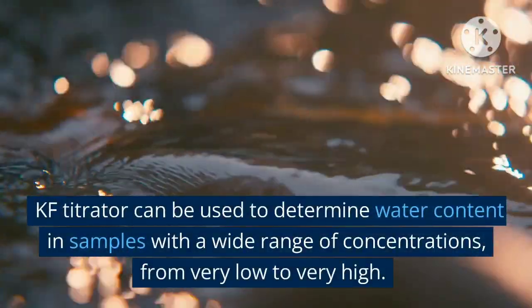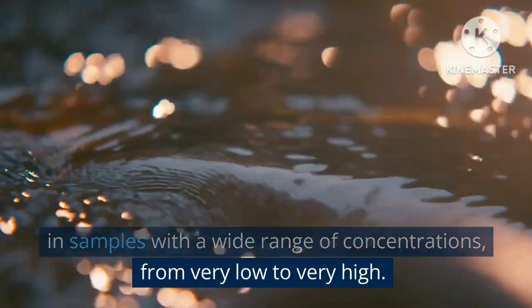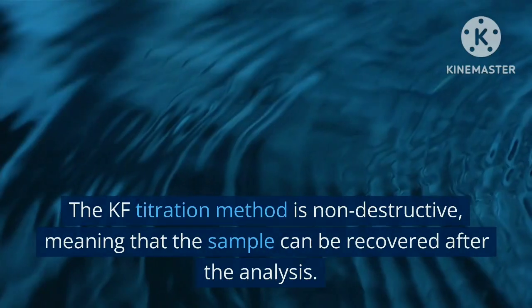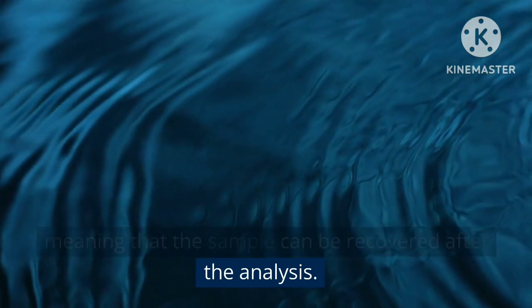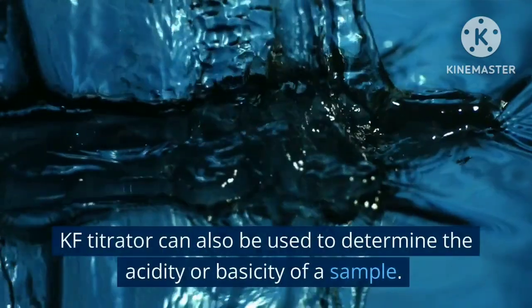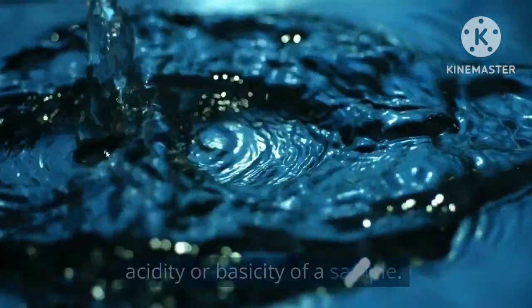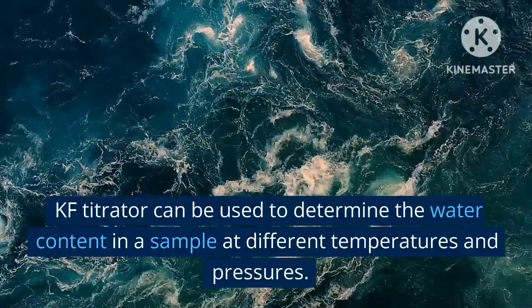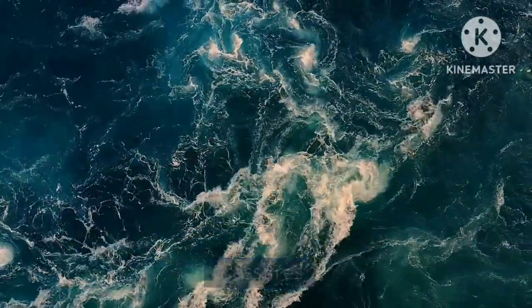KF titrator can be used to determine water content in samples with a wide range of concentrations, from very low to very high. The KF titration method is non-destructive, meaning that the sample can be recovered after the analysis. KF titrator can also be used to determine the acidity or basicity of a sample. KF titrator can be used to determine the water content in a sample at different temperatures and pressures.